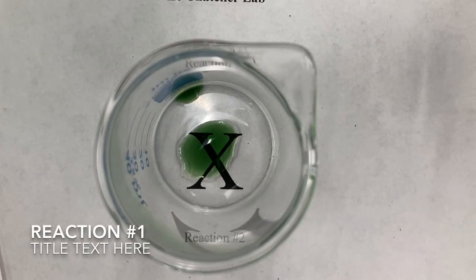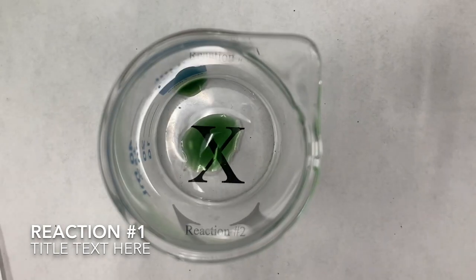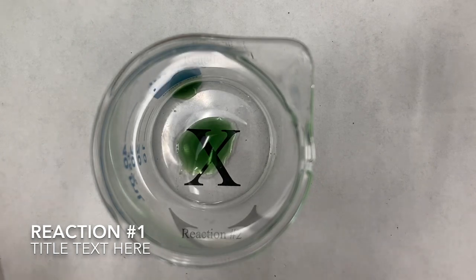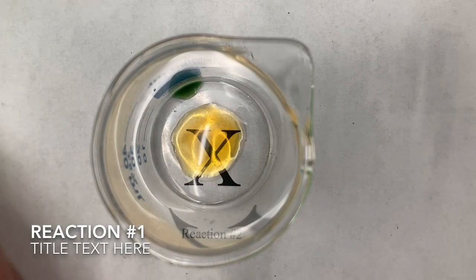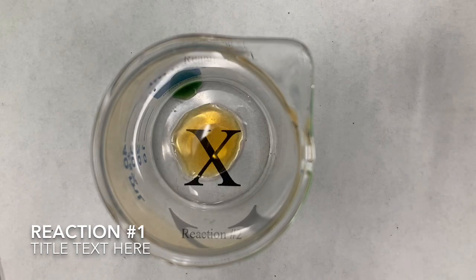And to that, we're going to add a few drops of acid. So here I'm going to add some HCl, and let's see what happens to the reaction. Okay, and this is with HCl added, which is the same as adding hydrogen.